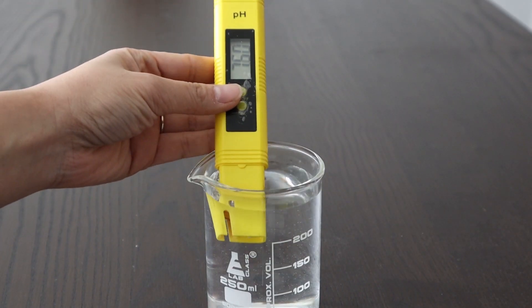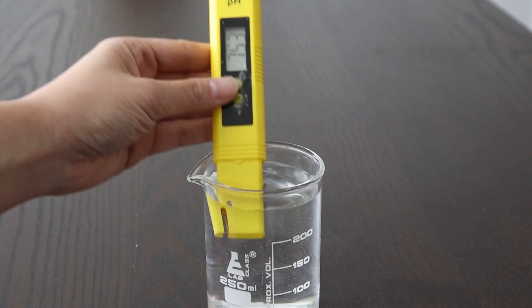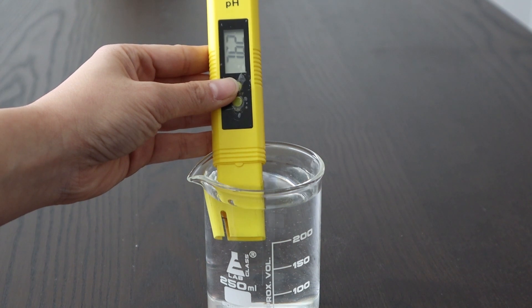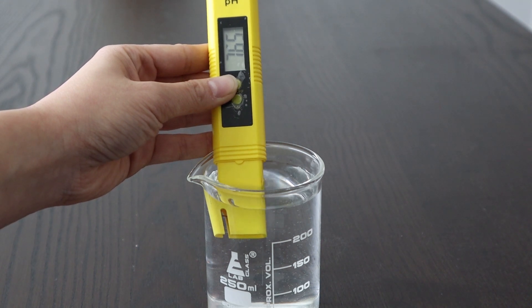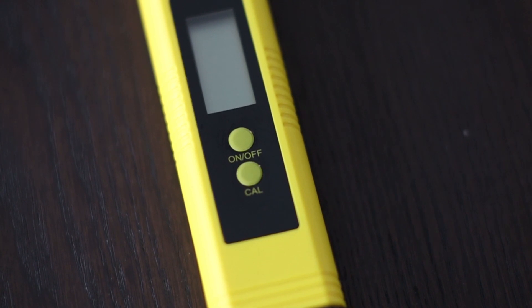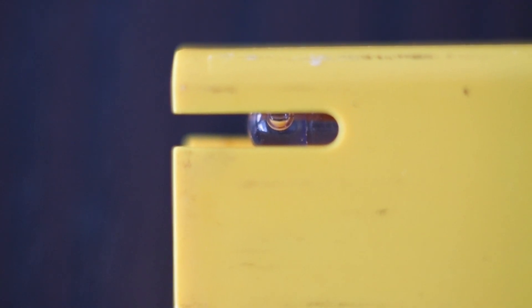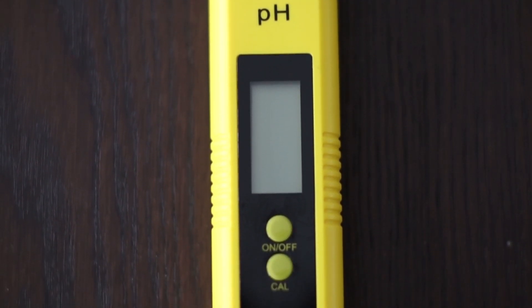Let's do one more test — I want to see what my tap water reads. Based on the standards and my calibration, I trust the reading will be pretty accurate. My tap water reads 7.65 — I trust it. My water is pretty hard here in California. Based on this calibration process, I would say this pH meter is pretty accurate between 4 and 7. As it gets further away, the electrode algorithm may be inaccurate, which is why when it tries to read a pH of 10 it doesn't quite get there. But since pH is on a logarithmic scale, I allow for some inaccuracies.